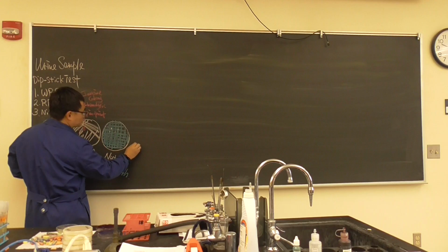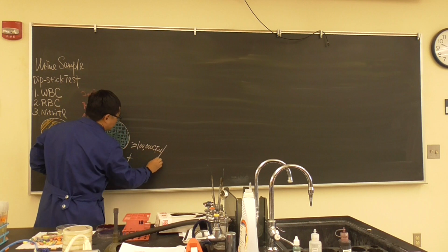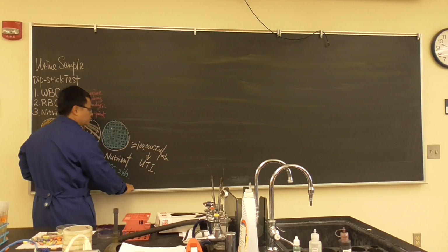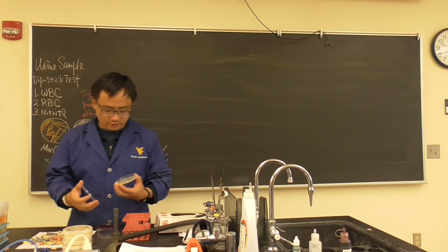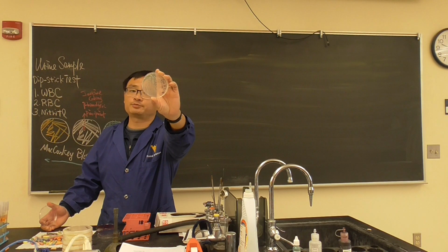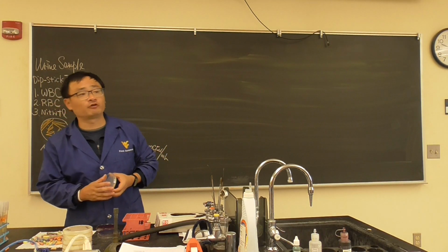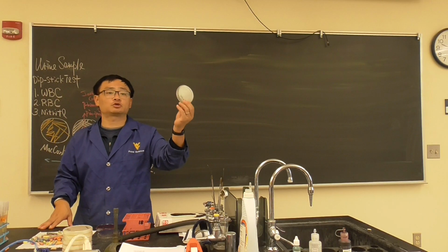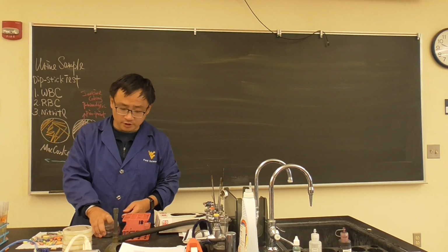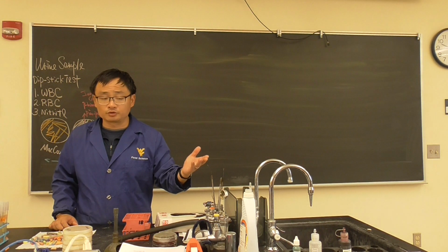If the colony population is more than 100,000 CFU per ml, this will be clinically diagnosed as UTI. So look at your plates. Do you think it's more than 100? Oh yes, more than 100. You can split them into two foci, and then you count one corner and multiply by 4. It's absolutely more than 100. It could be more than 300. So in this case, this patient is absolutely diagnosed as UTI based on these results.